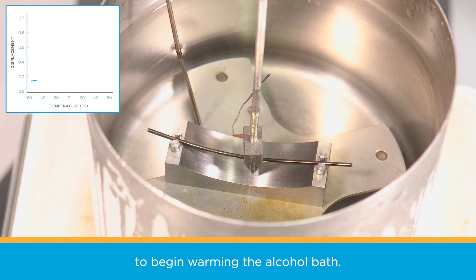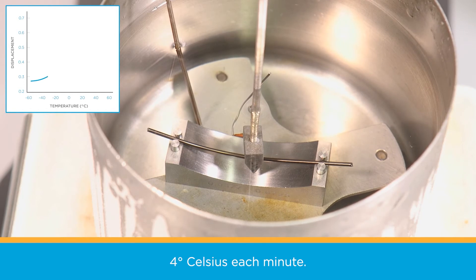turn on the hot plate to begin warming the alcohol bath. Be careful here — the heating rate must not exceed 4 degrees Celsius each minute.